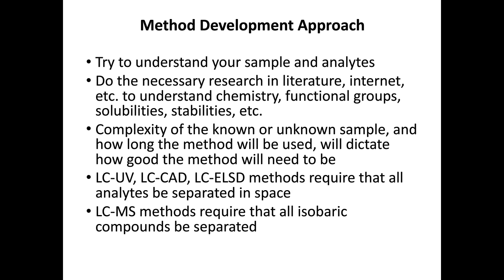Keep in mind that methods that use detection such as ultraviolet detection, charged aerosol detector, and ELSD all require that the analytes be separated in space. They must be completely separated. And LCMS methods require that compounds that have the same molecular weight be separated in space.